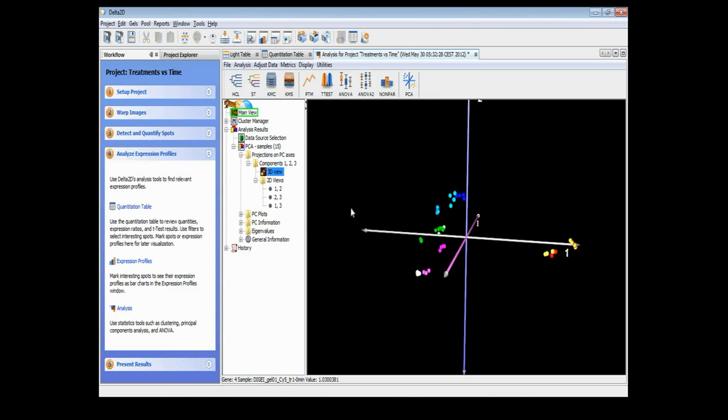After that, we are interested in certain changes between two groups, and that's of course up to your biological question, your matter of interest, what questions you have and what test you should use then. The simplest way is to use a t-test to compare two different groups. And comparing two groups means you have changed one factor, and the t-test says, okay, you can compare two groups that belong to the same factor, but have a variation within one factor, but not for the second one. So let's check that in Delta2D.